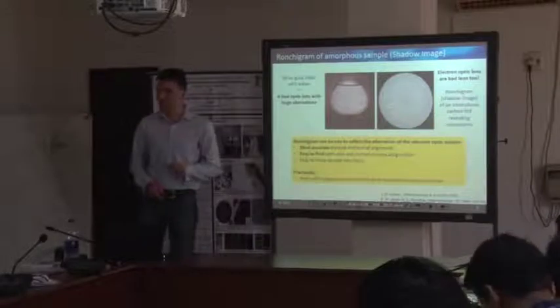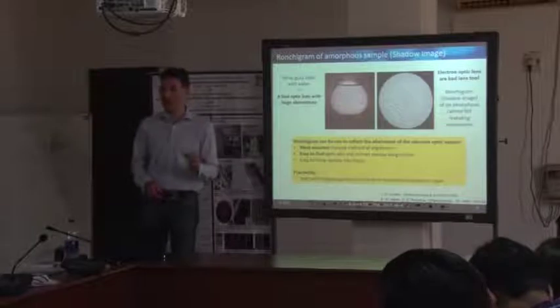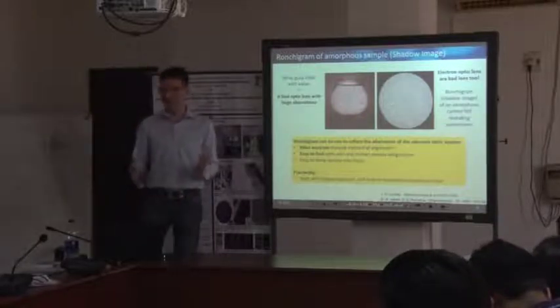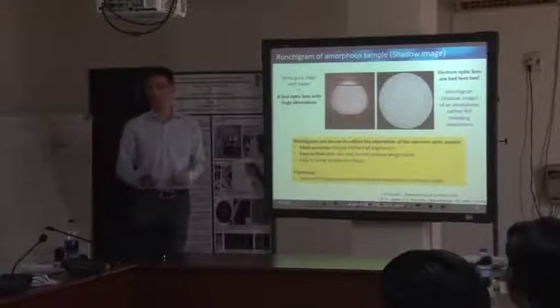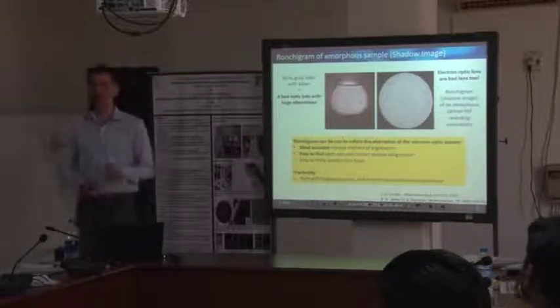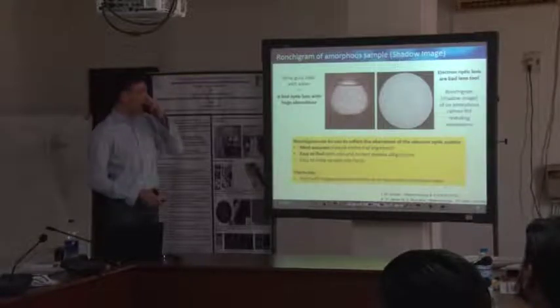If you don't have that, I would just put my electron probe somewhere in a very thin area of your sample, and after a certain period of time, almost any kind of material gets damaged, meaning that you generate your amorphous area by yourself, just by destroying your sample to some extent. It's on the nanometer scale, so it shouldn't matter.